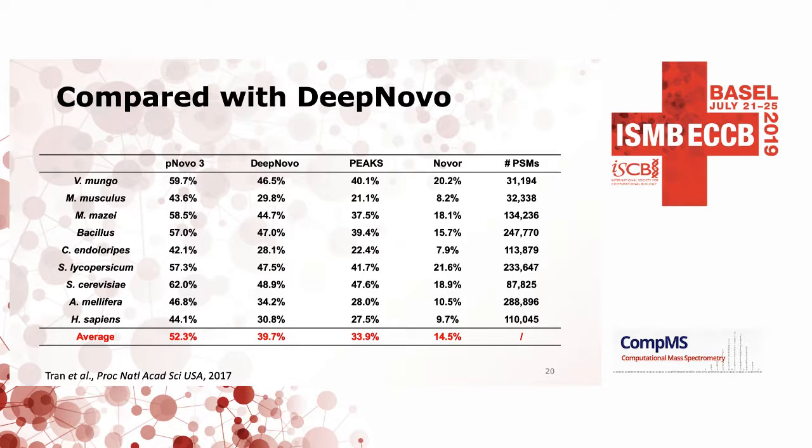This is always the hardest problem in de novo sequencing because the benchmark is from database search. Database search is more powerful and it can interpret some medium or low quality spectra. So I think maybe the other half of the spectra may be the low quality spectra. So they can be interpreted by database search, but not de novo sequencing.